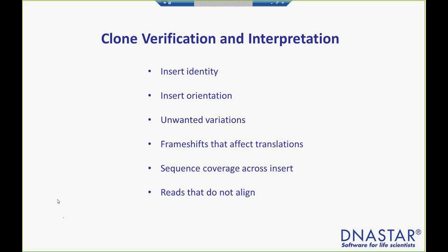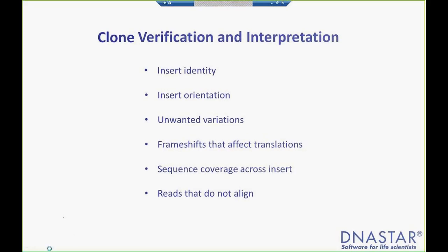I can align reads using SeqMan, but the interpretation can be challenging. Depending on how the reads align and where there are mismatches, those can mean different things. So we've built this feedback mechanism now, so that when we do the alignment, it will give us this feedback, so we can better understand any potential problems we have with clones that we've generated.